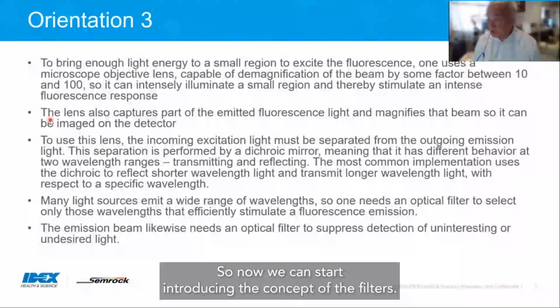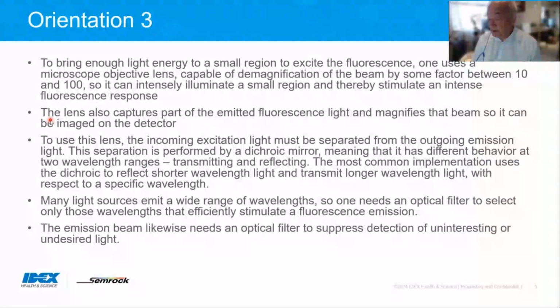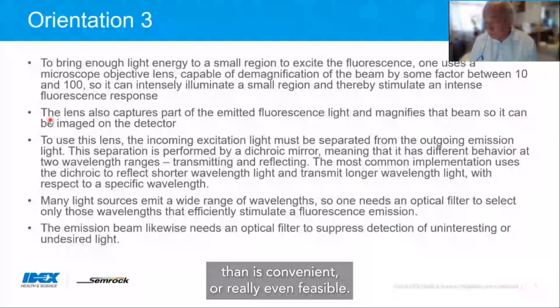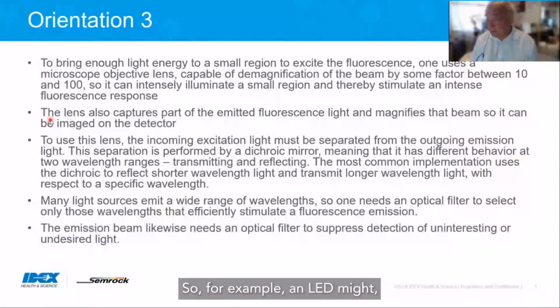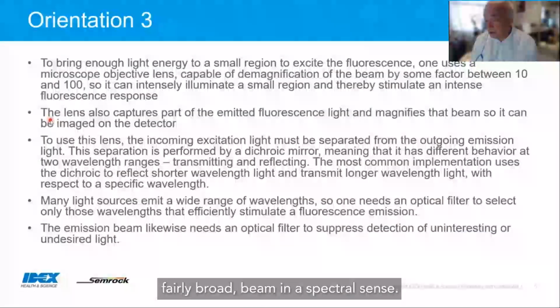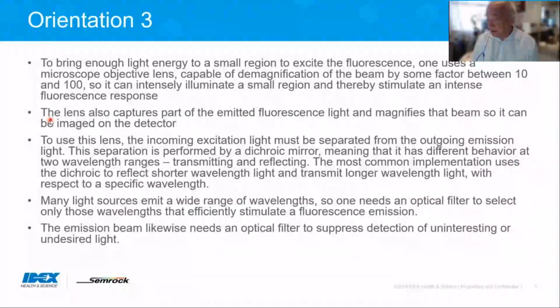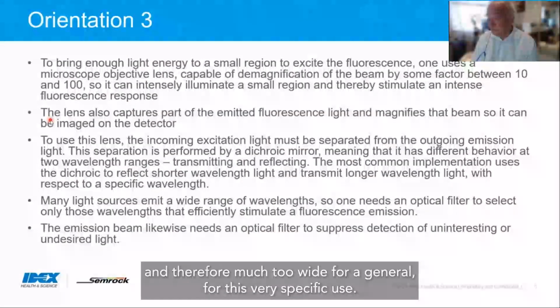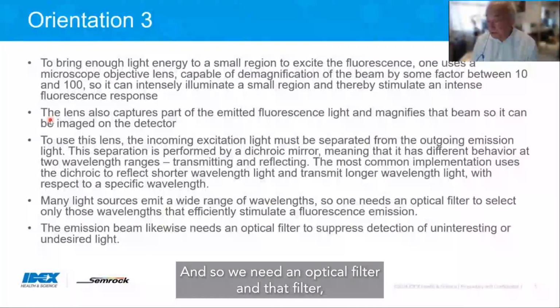So now we can start introducing the concept of filters. That is because many light sources emit a wider range of wavelengths than is convenient or really even feasible. For example, an LED might pump out a fairly broad beam in a spectral sense, or one of the older light sources has continuous spectra and is therefore much too wide for this very specific use. And so we need an optical filter.